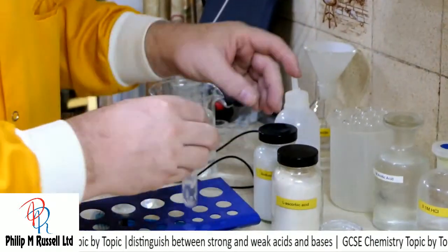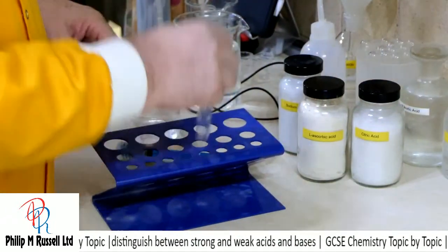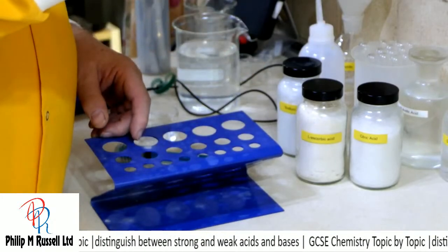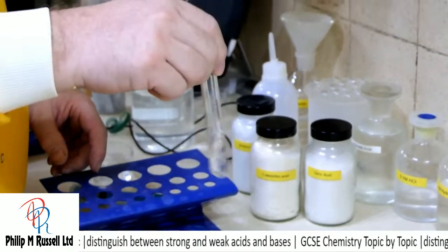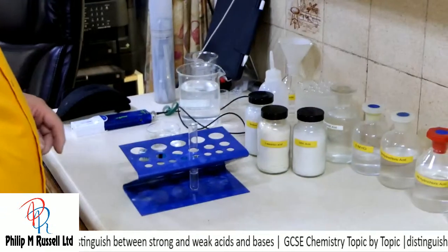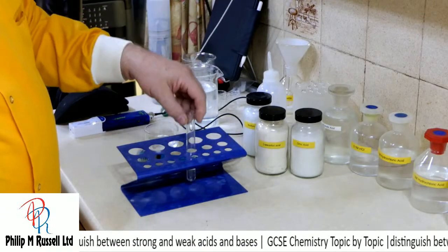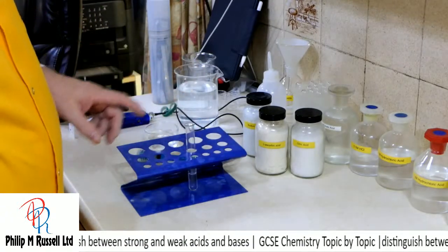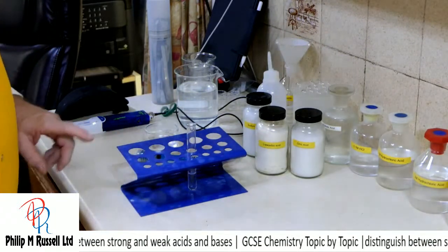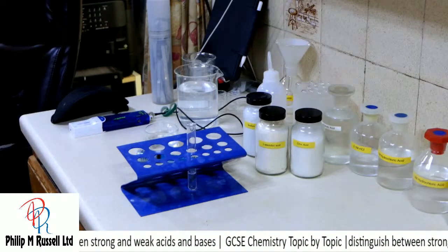I'd better put that back, and let's shake it and get it dissolved. It dissolved quite readily. And do I fancy putting my finger in there? The answer is no, I don't, because that is now quite acidic. And what we need to do is put in some universal indicator.